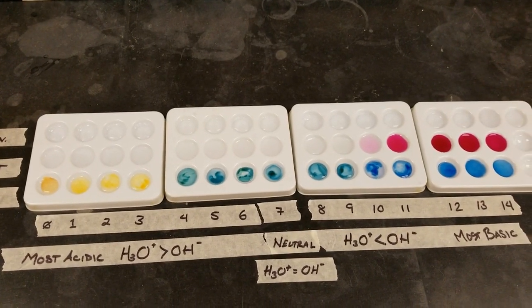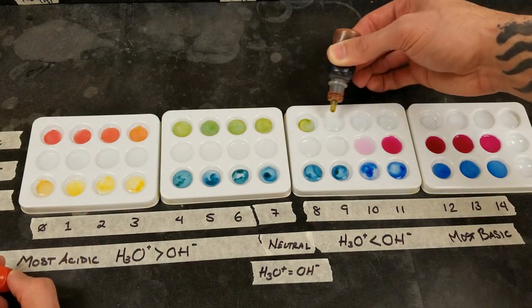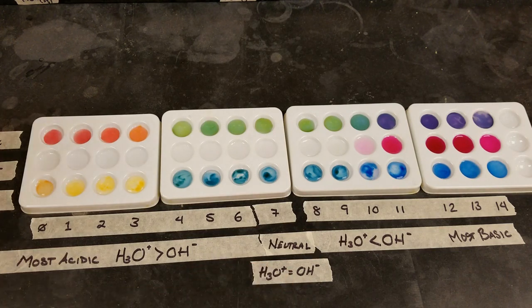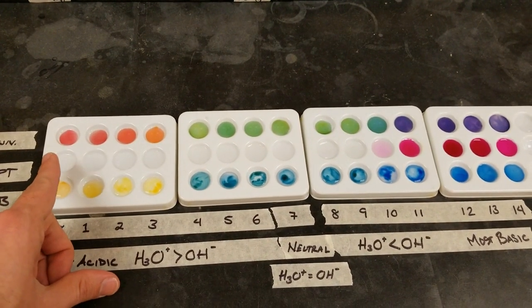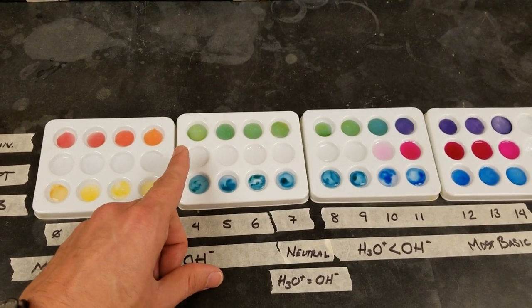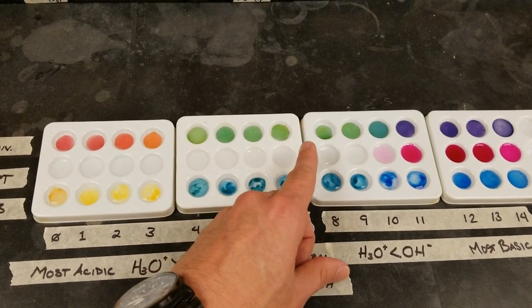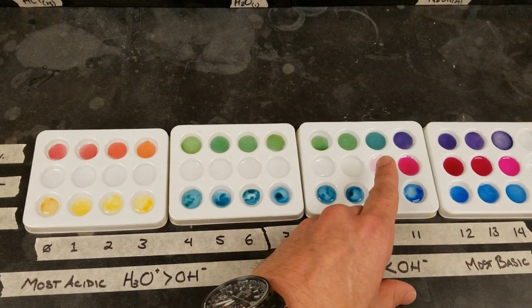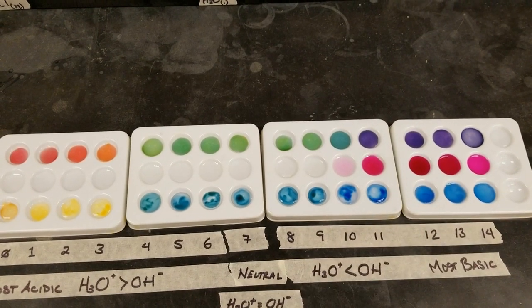Last is universal indicator, and with the universal you can see in the most acidic range red, then orange, and then in the intermediate range of acidity green, neutral and then a little bit in the weakly basic category still green, then transitioning to blue-green, and finally purple in the most basic solutions.